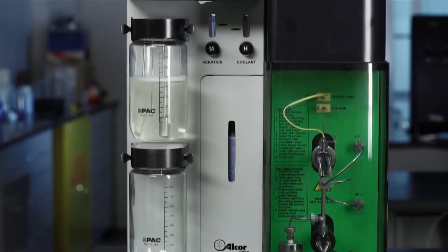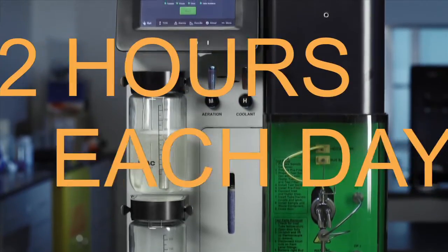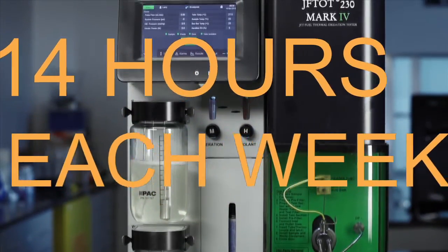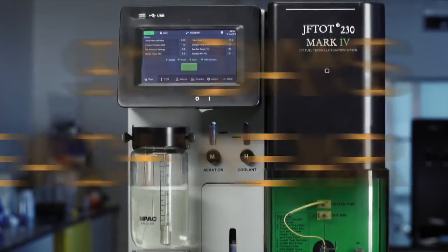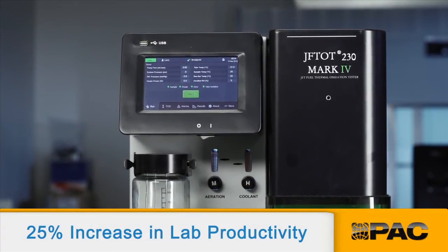If you run three tests every day, this time savings translates into a savings of 2 hours each day, or 14 hours each week, or 91 workdays each year. This means the Jephtot 4 can increase lab productivity by as much as 25%.